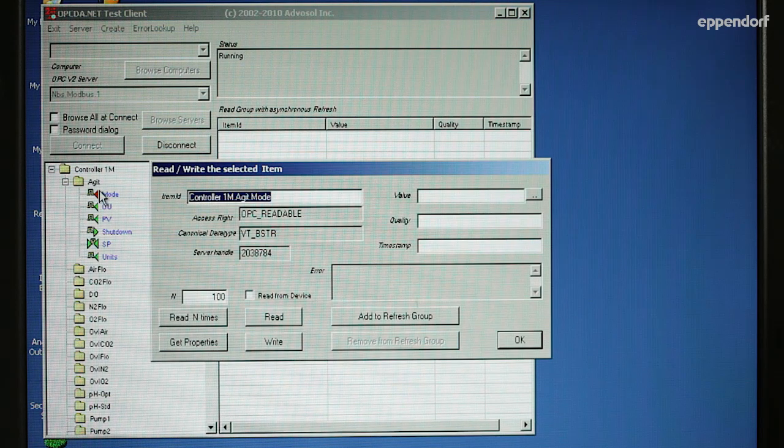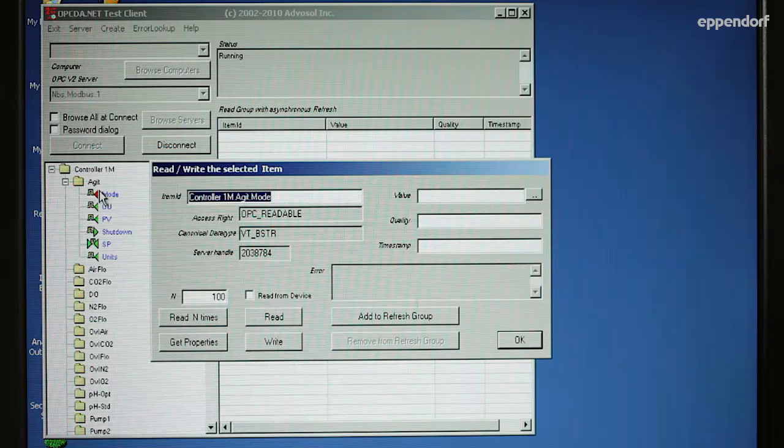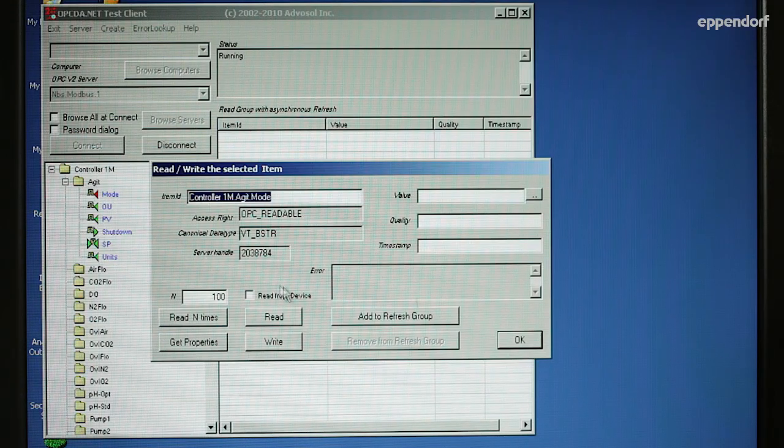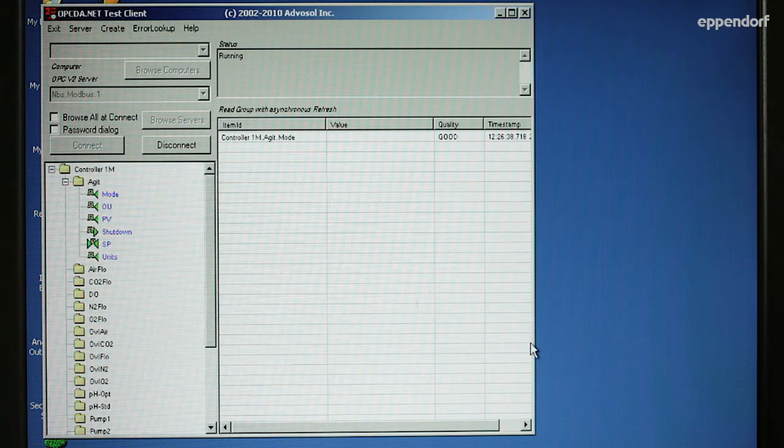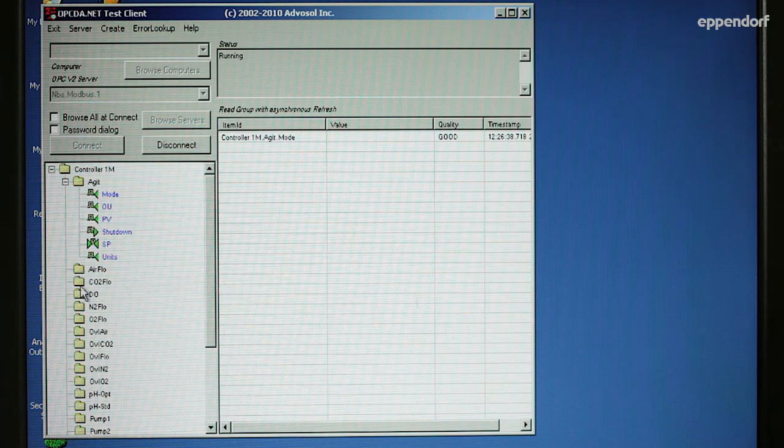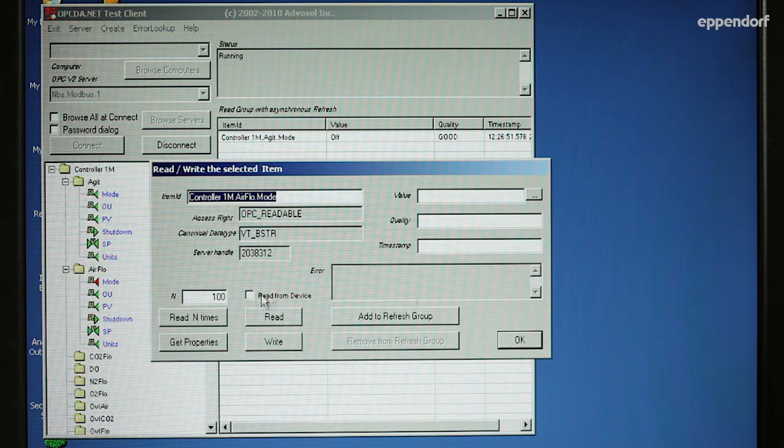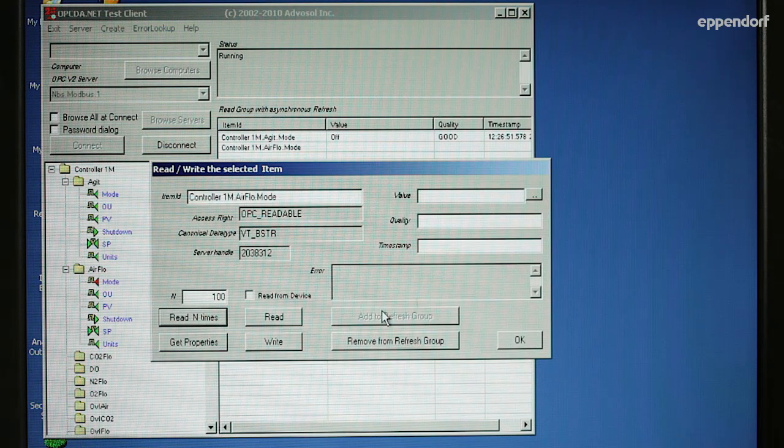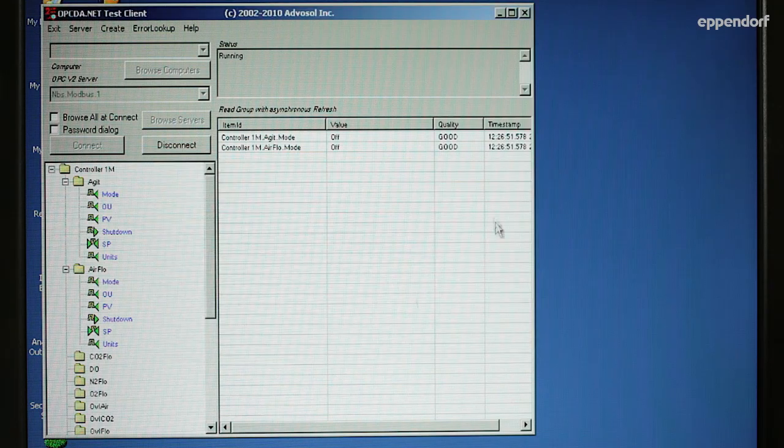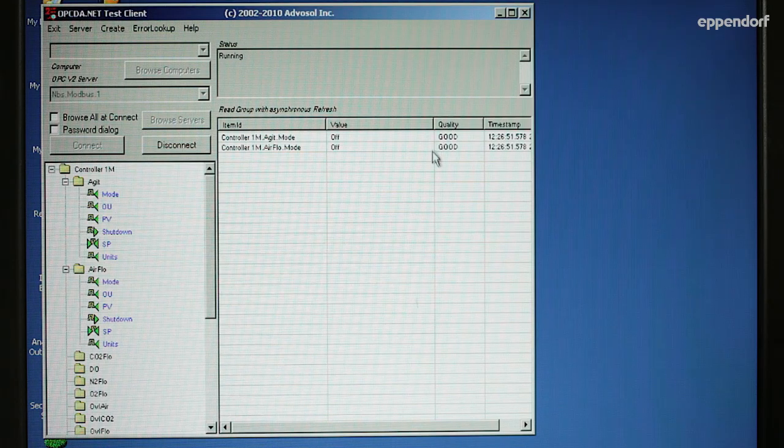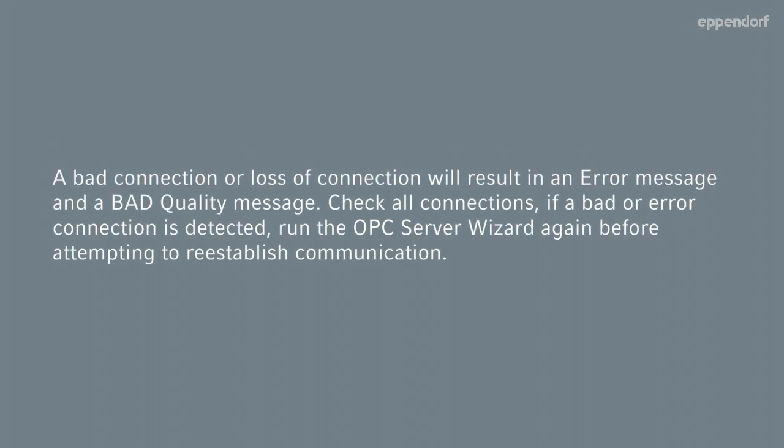Click on the data from the loop you would like to test. Then, in the pop-up window that opens, click on the Add to Refresh Group button. The data is now added to your test group. The information from the Test Client indicates whether your fermentation hardware is communicating with BioCommand. A bad connection or loss of connection will result in an error message and a bad quality message.